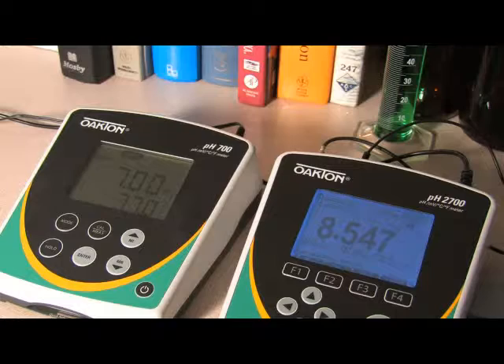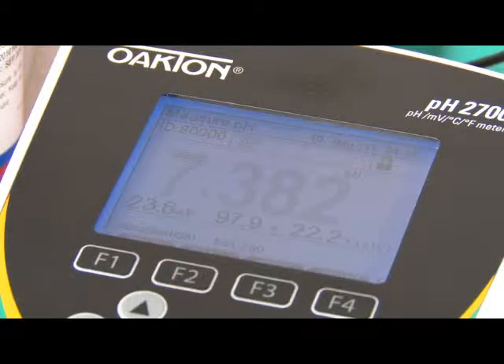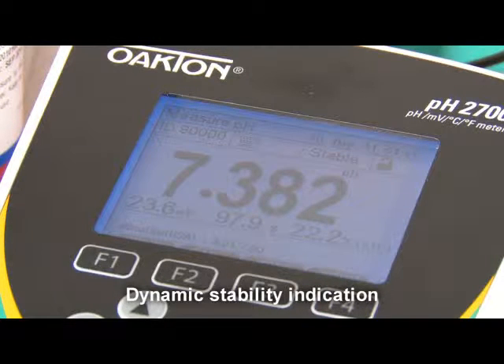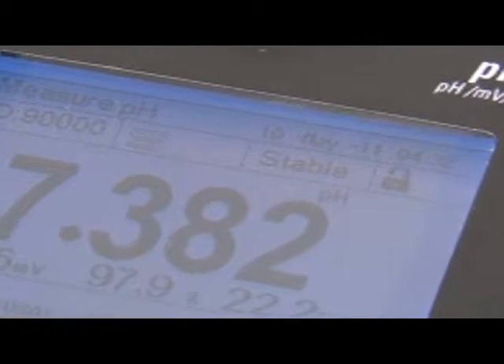Turn backlighting on or off as needed. Dynamic stability indicators show an unstable reading as faded and fuzzy, in contrast to the sharp, crisp value of the stable reading. As you can see, the unit clearly indicates the stable reading.